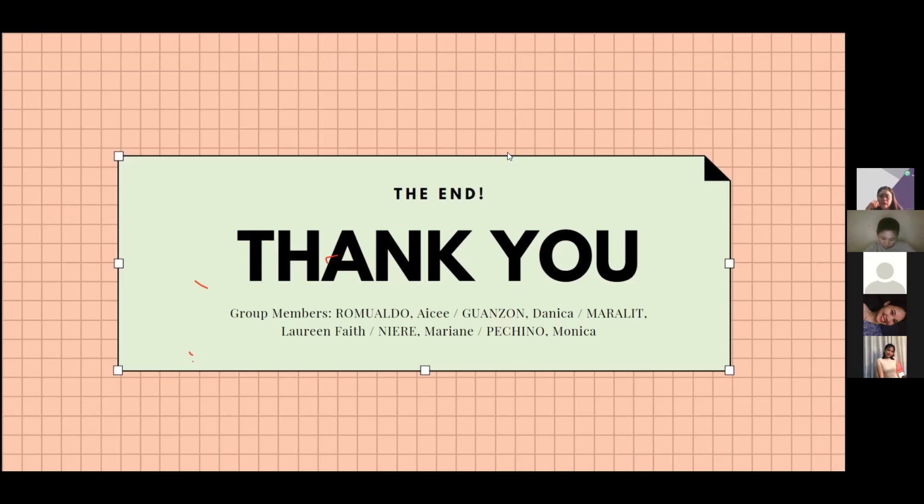Never eat food, drink beverages, chew gum, apply cosmetics including lip balm, or handle contact lenses inside the laboratory too. We also learned how to properly use and operate the Bunsen burner and what precautions we should take when handling flammable, hot, and splashing liquids inside the laboratory when handling the Bunsen burner. That would be all po.